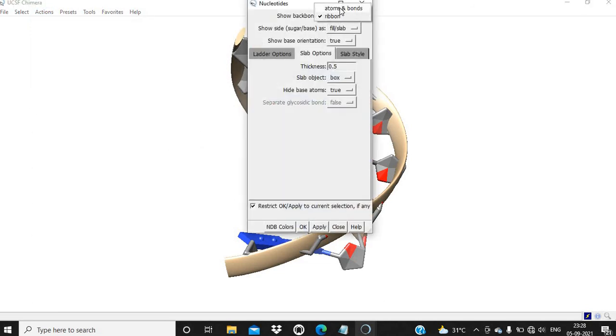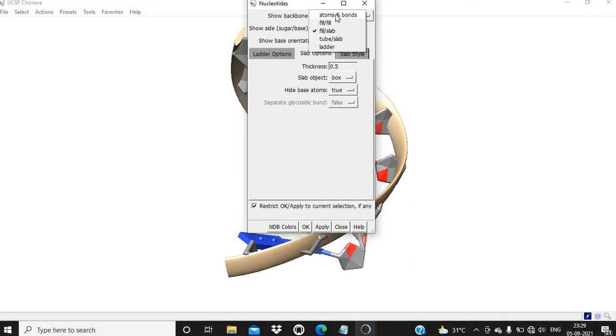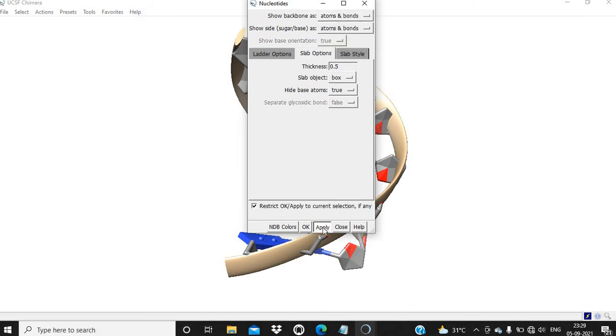We are going to show the backbone in atoms and bonds and also the sugar base in atoms and bonds, then apply.